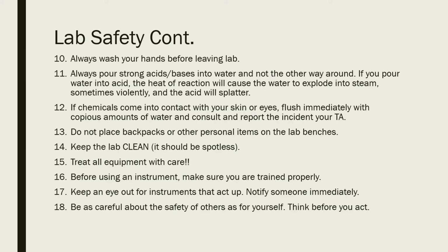If you have any questions on an instrument or you are unsure, always make sure you get help. We don't want you to be confused and end up damaging machinery. Another good thing to note is if machines don't act properly, always talk to either the TA or an instructor so that we can figure out what's going wrong with it. And then finally, always make sure to be careful. You don't want to hurt yourself or others, so make sure you think before you do something in the lab.